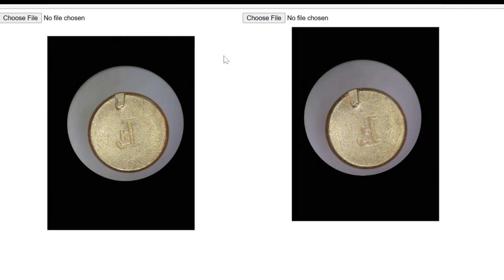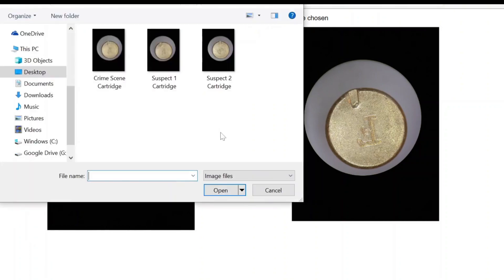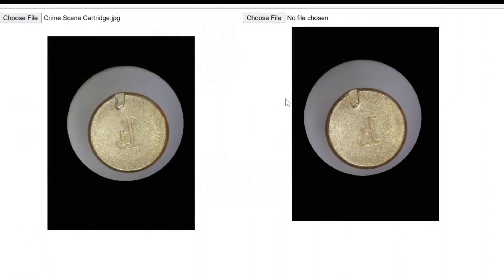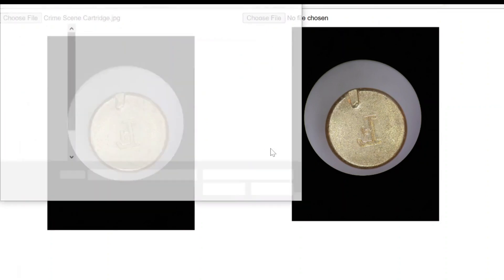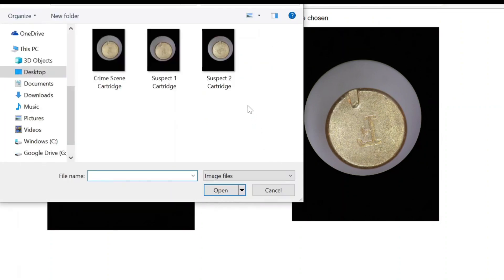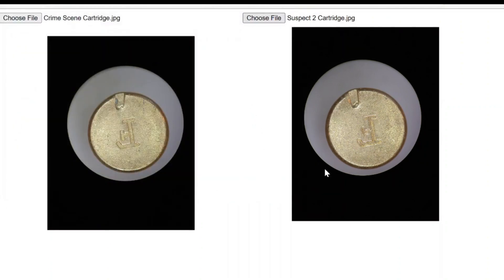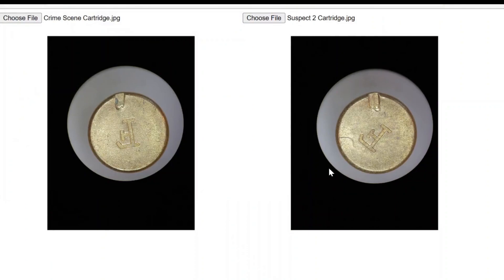So let's check it out. Let me jump to this locally run virtual comparison microscope. You can see there's images already loaded, but I could choose file and say, what are you looking for? I'm looking for the crime scene cartridge. And I'm going to look for on the second side, let's do the suspect two cartridge. And there it is.